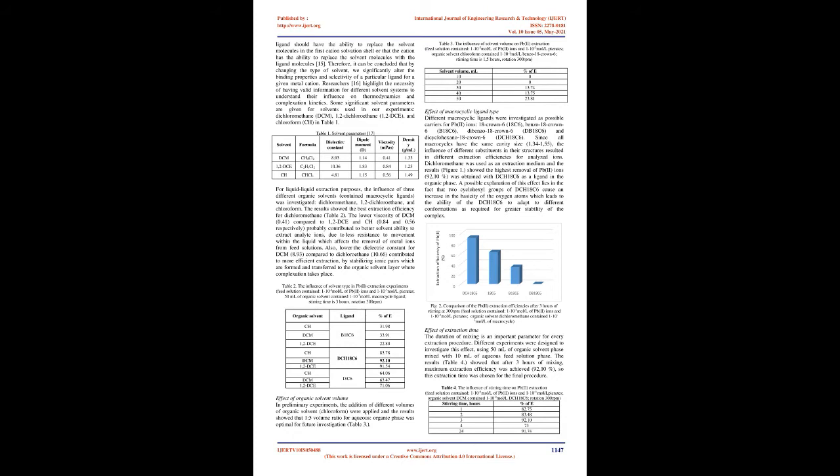Back extraction procedure. After separation of the organic layer, extracted metal ions were stripped from organic solution using 11 ml of an aqueous solution, buffered at pH = 5, acetic buffer, containing disodium EDTA, 1×10⁻³ mol/L, and Triton X-100 surfactant, 1×10⁻³ mol/L.